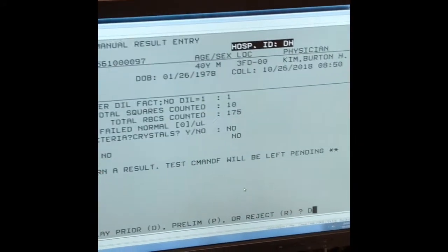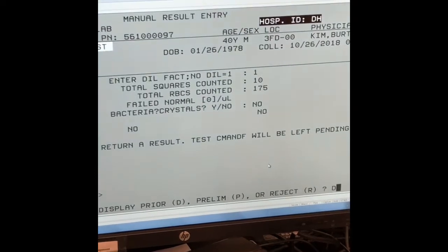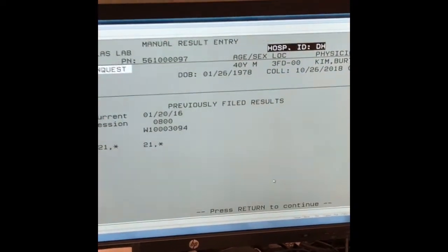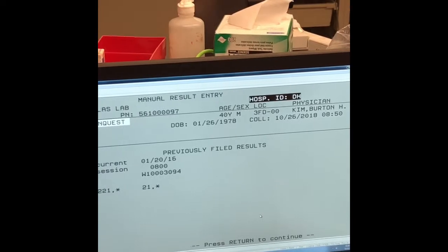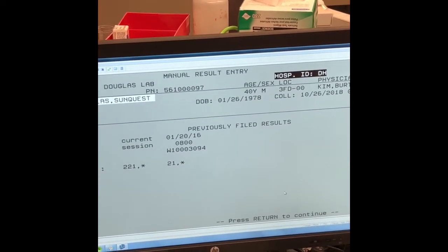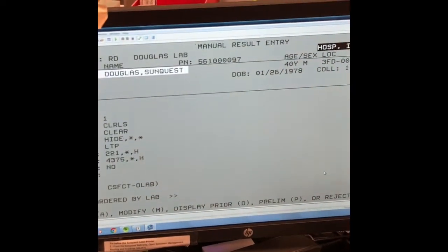You can select in SmarTerm, we have a D, or in GUI, we have some previews that we can go back and forth and see. And in Sunquest, it requires you to do that QA review before you can even approve it. So that's what that display is. Because they randomly ask you that question, you will explain: I like to display and double check it and get my previews. Of course, this person doesn't have to, but there you go. So that's pretty much what we have.